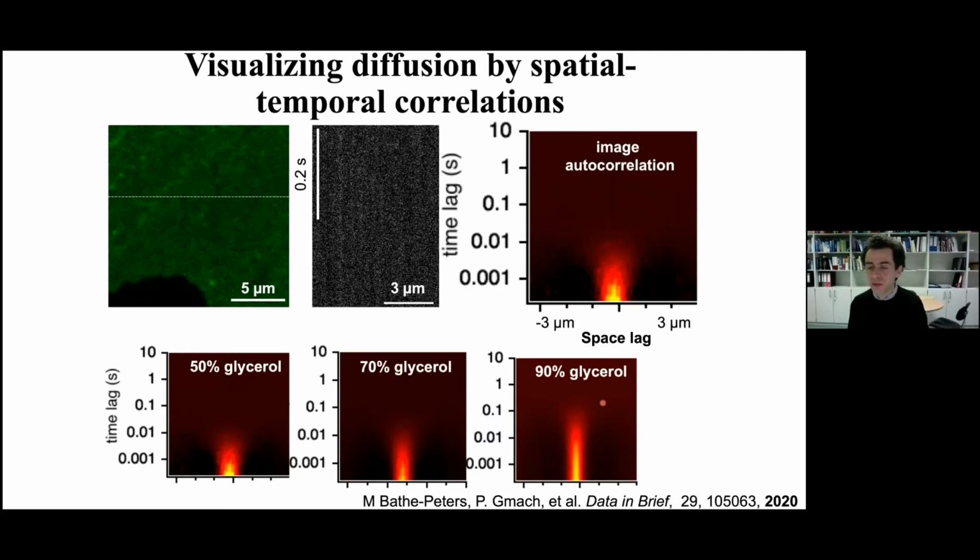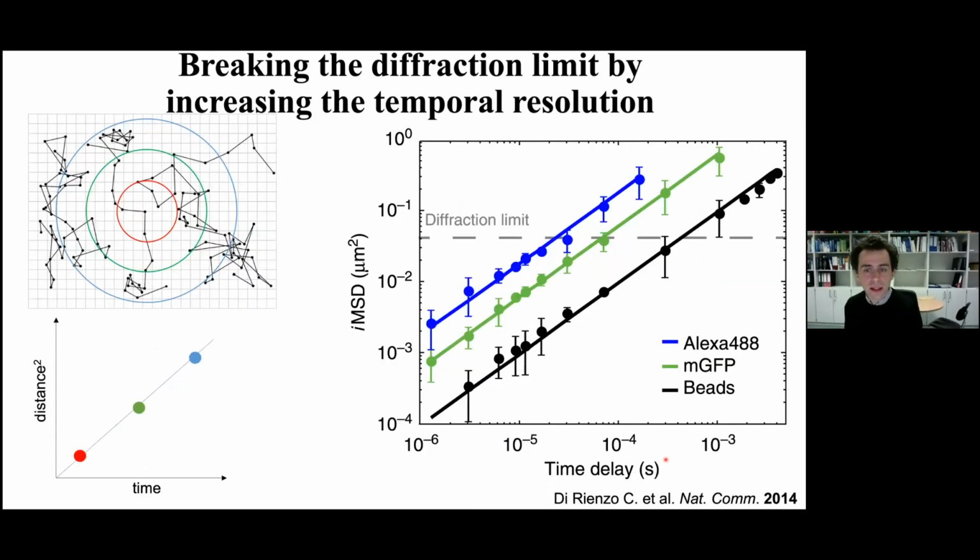I wanted to show you this just to give you the idea that you can do analysis on your data, even without seeing individual molecules, and reconstruct the average behavior with a very good temporal resolution, because here you see we are going below 1 millisecond in these traces. So why am I telling you all of this? Just keep in mind this graphical analogy. This is kind of a plume. It opens up fast if the molecule diffuses fast. It opens up slow, meaning the molecule sits for a long time in the same position before being able to diffuse away.